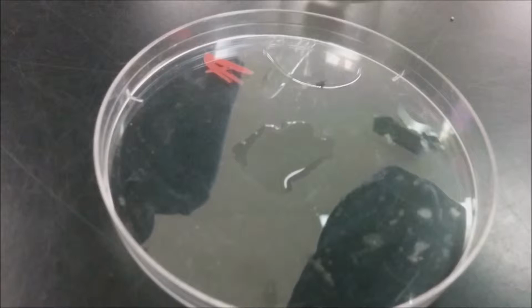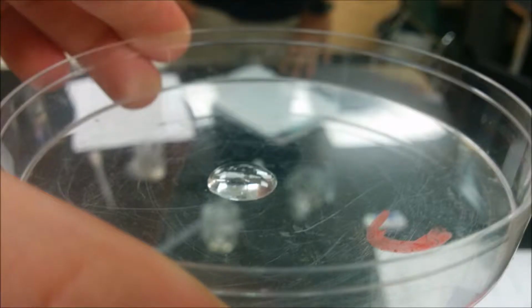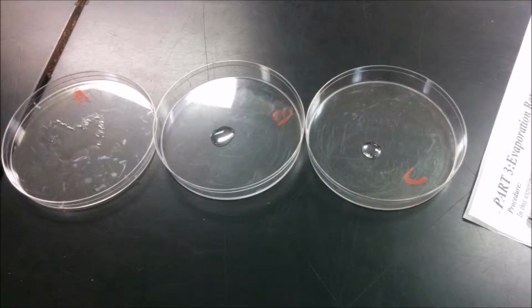It dispersed very thinly, and there was no noticeable hump. Meanwhile, liquid B did form a bead shape due to its greatly reduced surface area for the same volume, and there was an observable hump formed. Lastly, liquid C took up the least surface area, resulting in a very circular shape with the largest observable hump. To match these results with the specific liquids, we have to go back and look at surface tension.